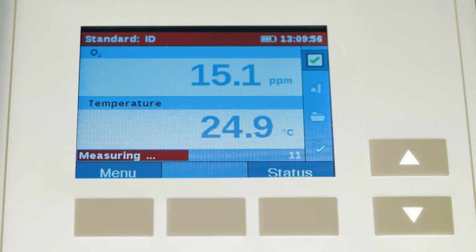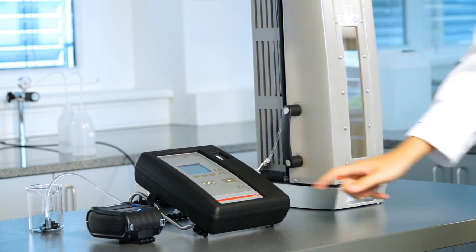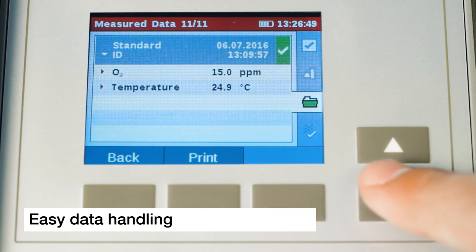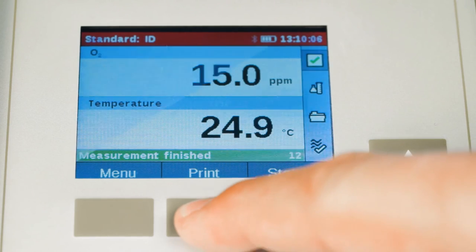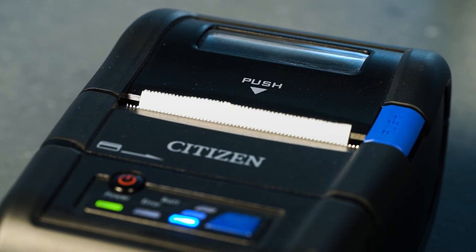Once your measurement is done, another wide range of options opens up. You can save up to 500 measurement data sets directly in the instrument. Furthermore, it also saves all O2 system checks in order to ensure full traceability. And we've made sure that it's really easy to export data. So all in all, OxyQC Wide Range gives you more options — and that's what this solution is all about.